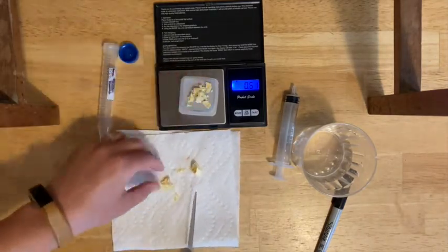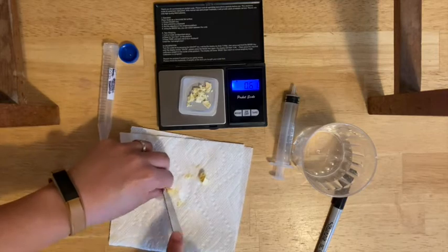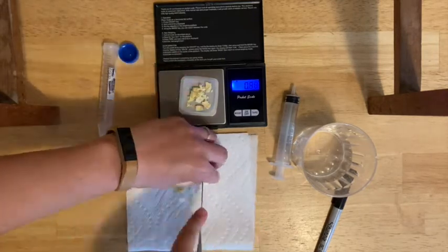You may need to cut a little more — that's fine. Try to get as close to one gram as you can.